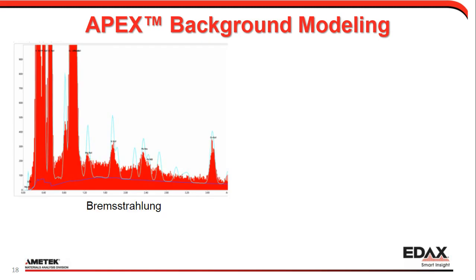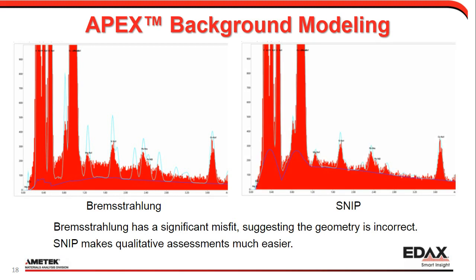We have something like this. Again, this is not an ideal sample, but just for illustration purposes, and this addresses one of the other questions that was in here. We can see here in the low energy range, there's a lot of modification to the Bremsstrahlung background as you start to hit the different absorption lines inside the sample. And in the low energy range, it's very important to have the absorption modeling correct. So using a linear fit in the low energy range can create issues, depending on what kind of absorption you have down there and how precise you're trying to do quantitative analysis down in that range.